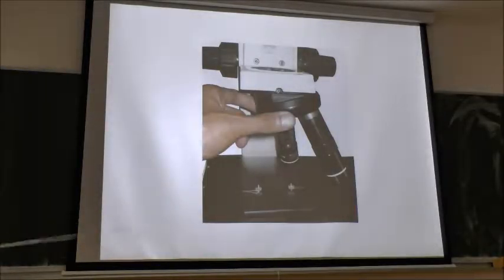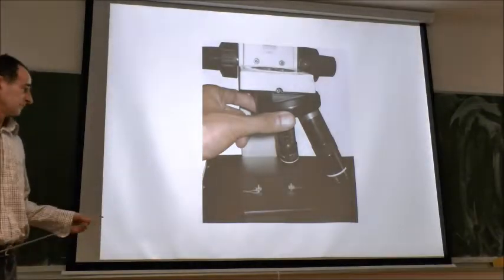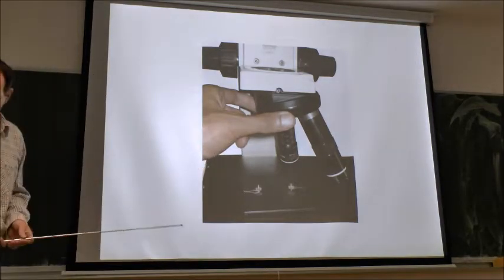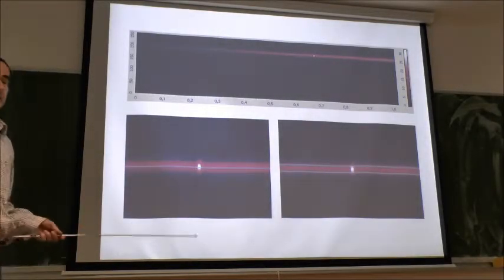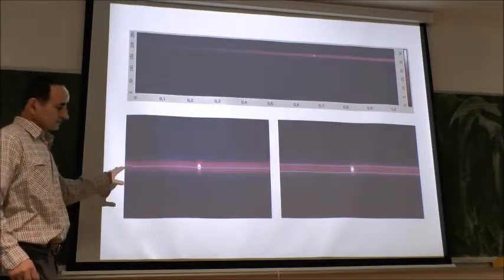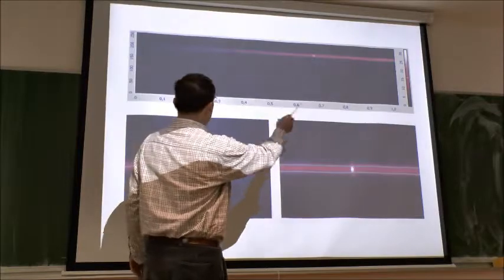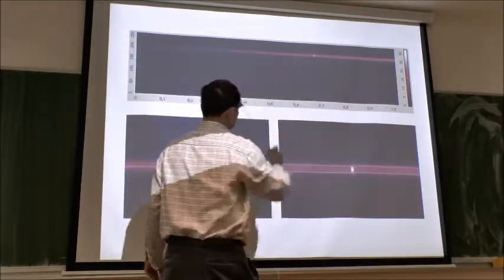Then, how we collect Raman spectra. We simply put our sample on the microstage. So it's here. This is an optical microscope, and the instrument would adjust itself. Then you push a button and you get an image of the scattered light on the CCD camera. So this is your first guess. This is the image of the Raman signal.